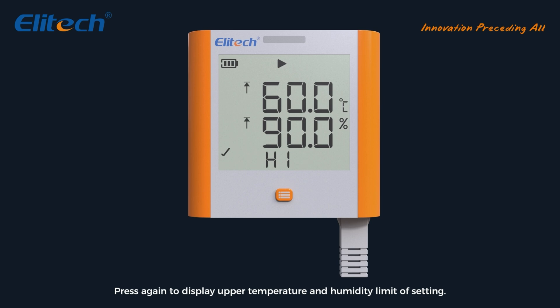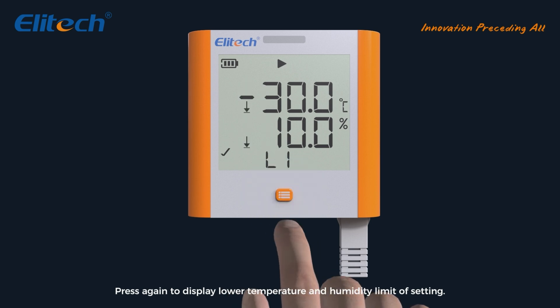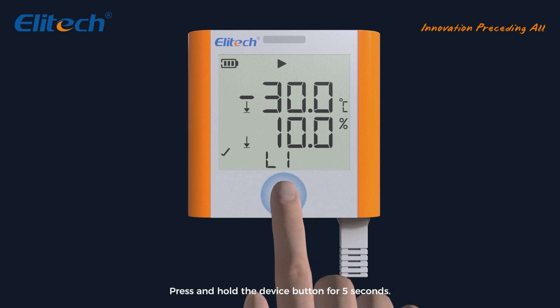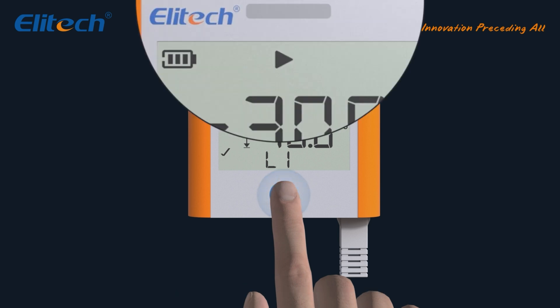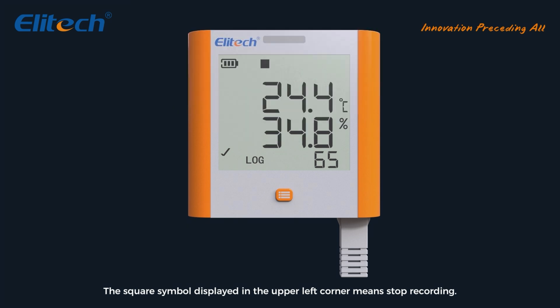Stop the device recording if necessary: press and hold the device button for five seconds. The square symbol displayed in the upper left corner means stop recording.